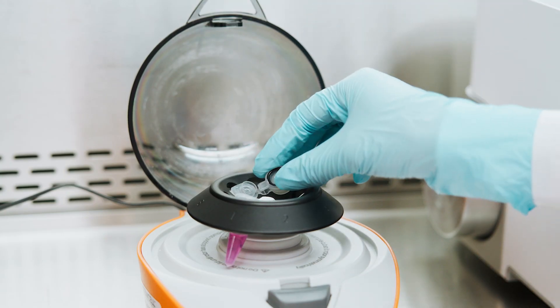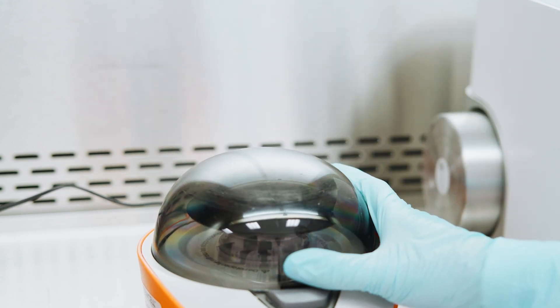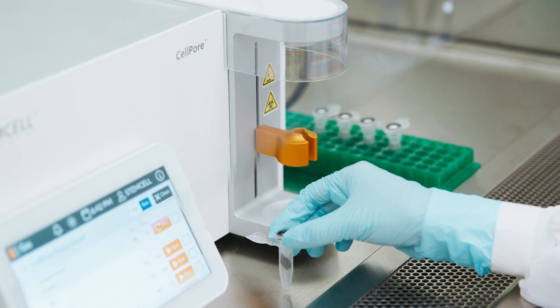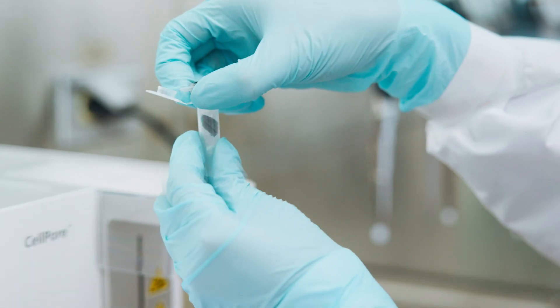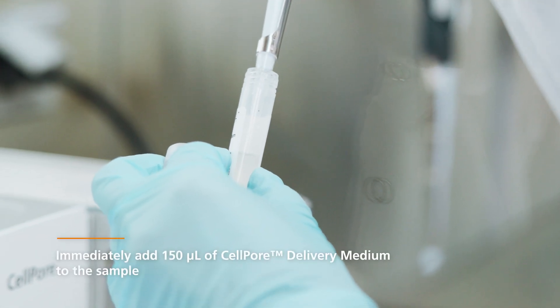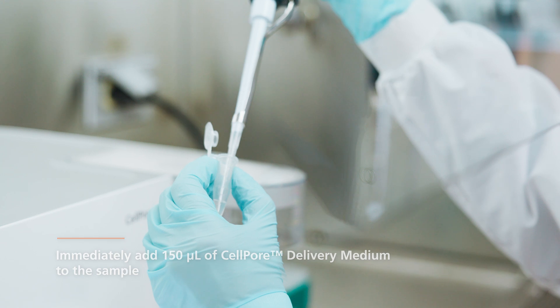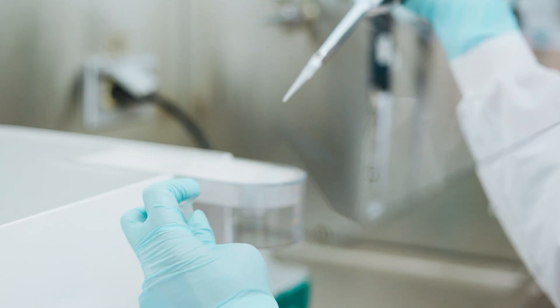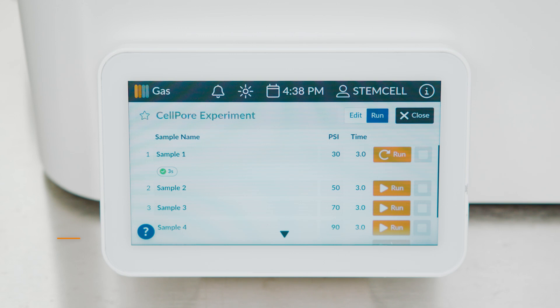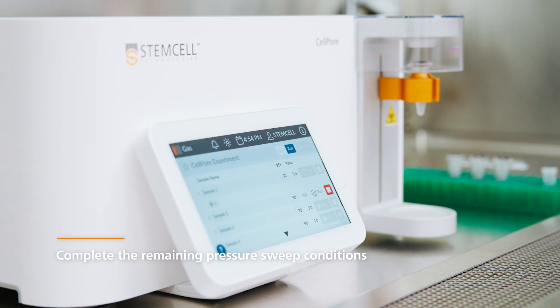Run the cartridge in a mini centrifuge to maximize sample recovery. Alternatively, gently tap the tube to collect the sample at the bottom of the collection tube. Remove and dispose of the used cartridge insert from the collection tube. Add 150 µL of CellPore delivery medium. Close the cap on the collection tube. Repeat this process, loading the next cartridge and running the remaining samples under 50, 70, 90, and 110 PSI conditions.